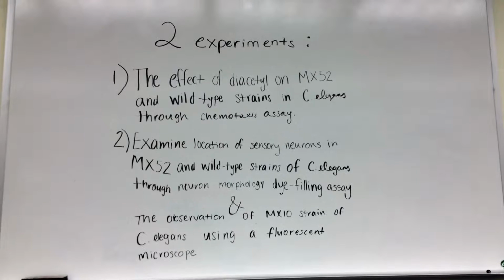For our investigative project, we performed 2 experiments: the effect of diacetyl on MX52 and wild-type strains in C. elegans through chemotaxis assay, and examine location of sensory neurons in MX52 and wild-type strains of C. elegans through neuron morphology dye-filling assay. And finally, the observation of MX10 strain of C. elegans using a fluorescent microscope.